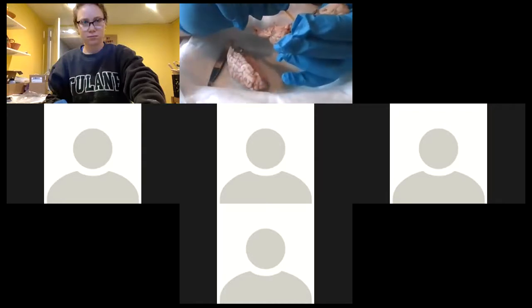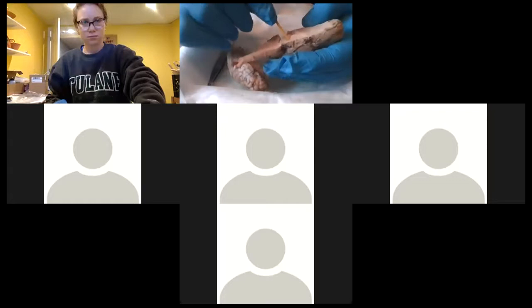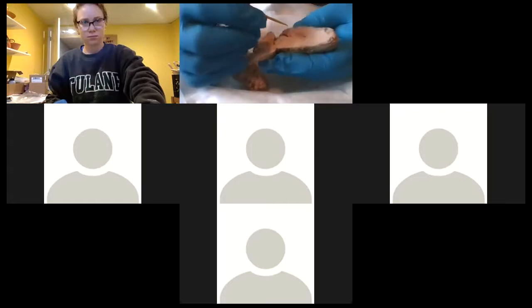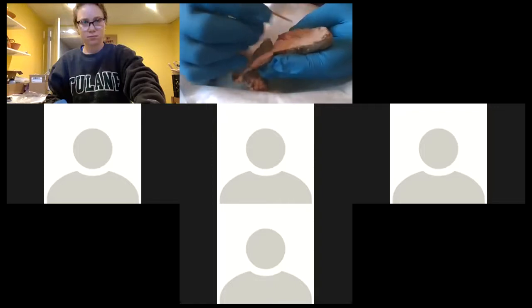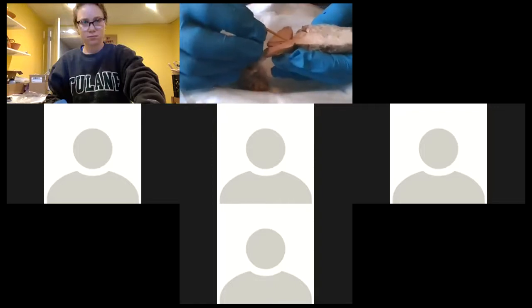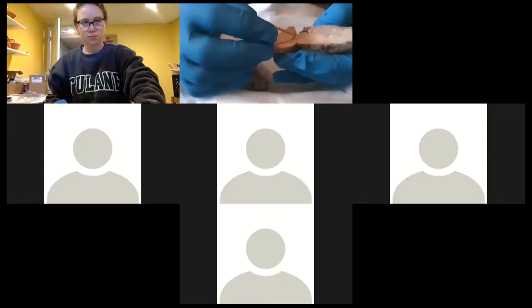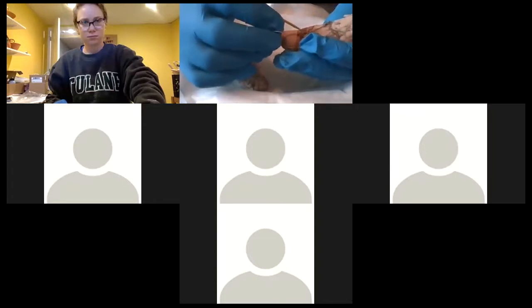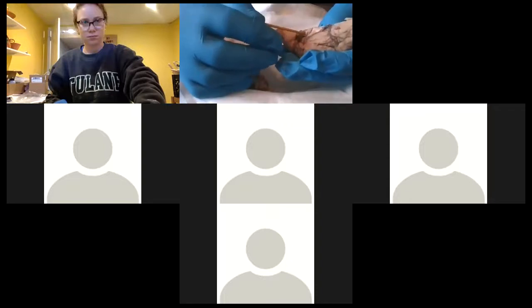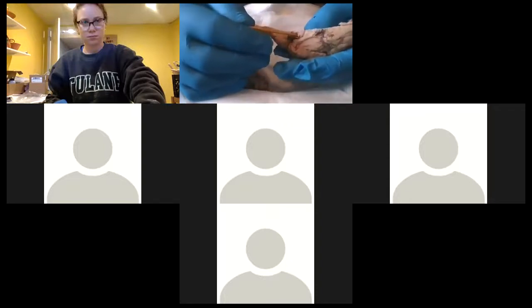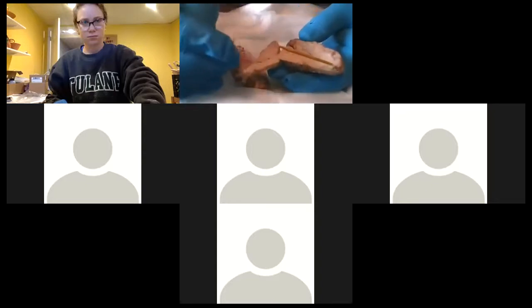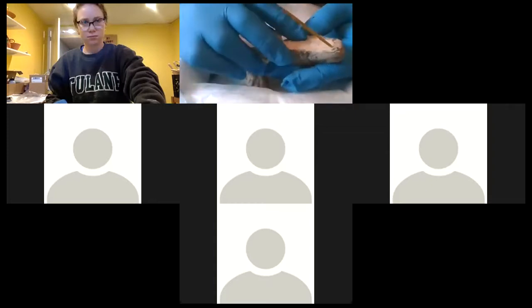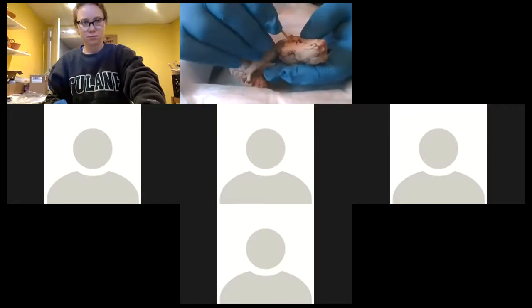Hypothalamus will be here. You really can't see the pituitary stalk or the pituitary gland here. You can still see the sulci and the gyrus. This area right here would be your cerebral aqueduct coming from the third ventricle, which is just adjacent to the thalamus. And the hypothalamus, I really don't see it so well, but anterior would be your mammillary body. Frontal lobe here. So feel the tissue. Look at the different texture of the tissue. These brains are very small, so it's not that easy to see everything, but you really have to take a closer look.